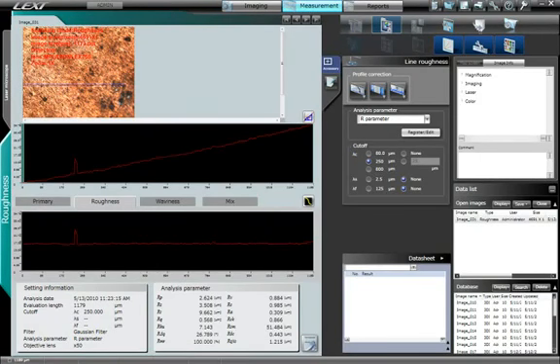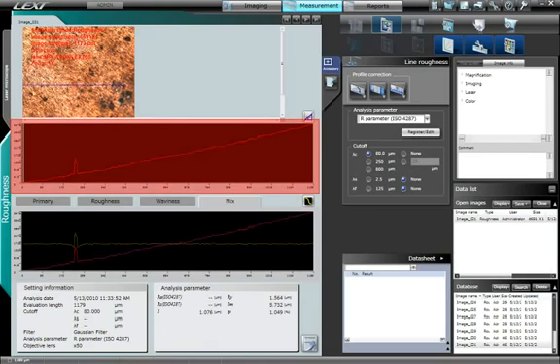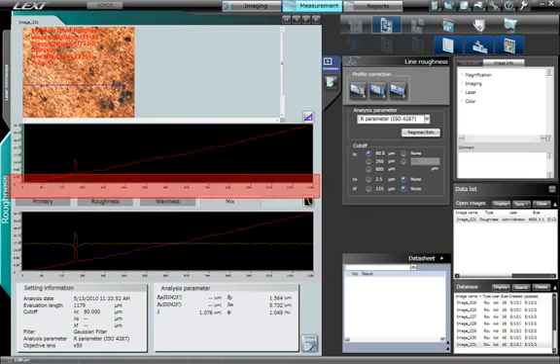Once the acquisition is complete, we can click on the Measurement Mode button to process the image and measure roughness. The top graph displays surface roughness. In this graph, the x-axis represents the evaluation length, whereas the y-axis represents height values. The slope in this roughness profile denotes that the sample is not flat in nature. Therefore, we can apply an inclination correction filter to correct for this slope.